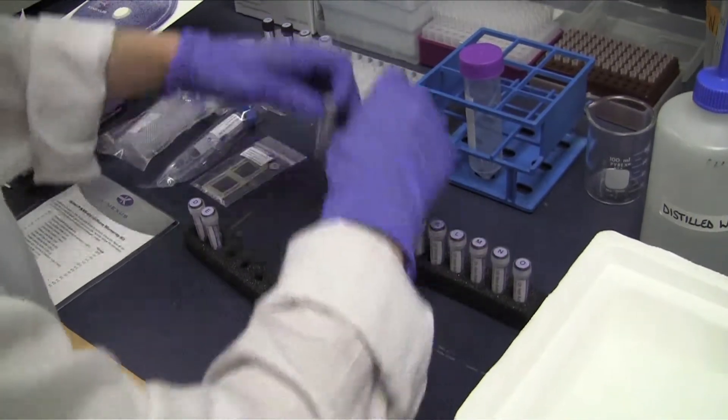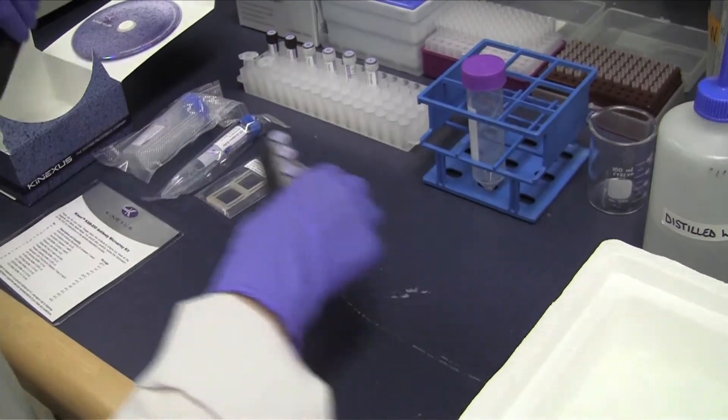For the dye labeling of your lysates you will need vials F, G, H, and I.